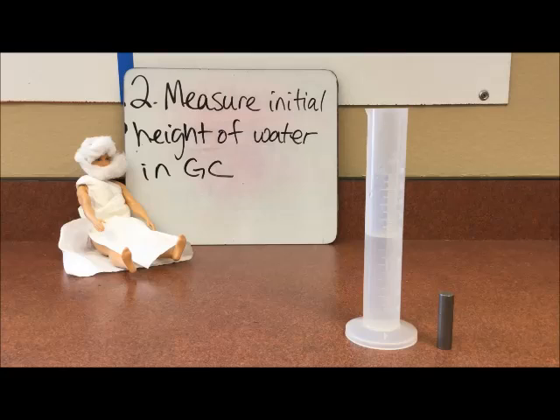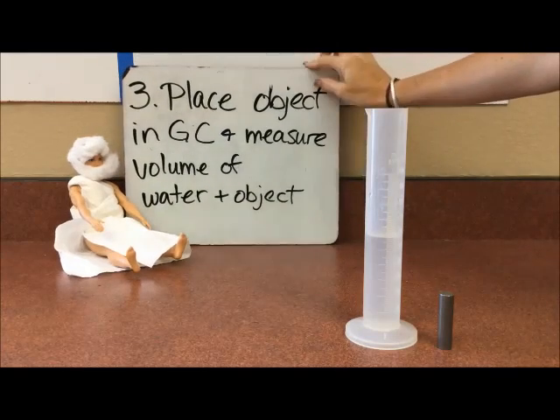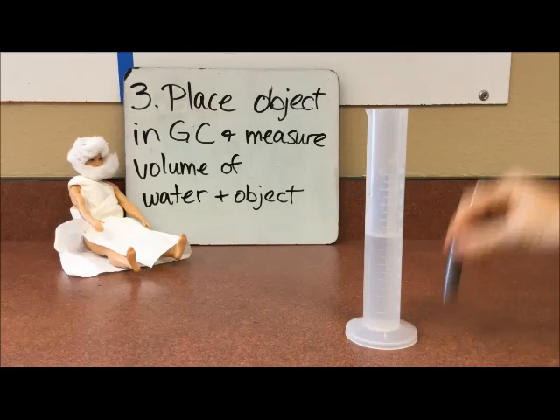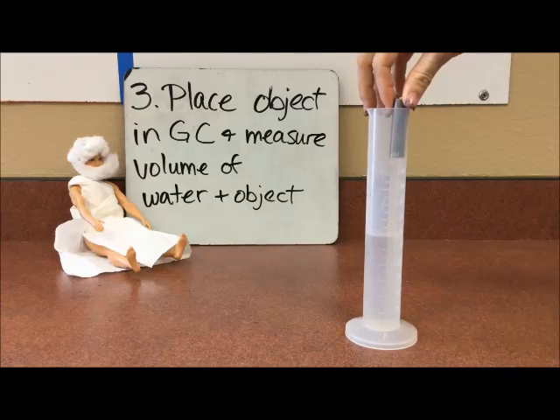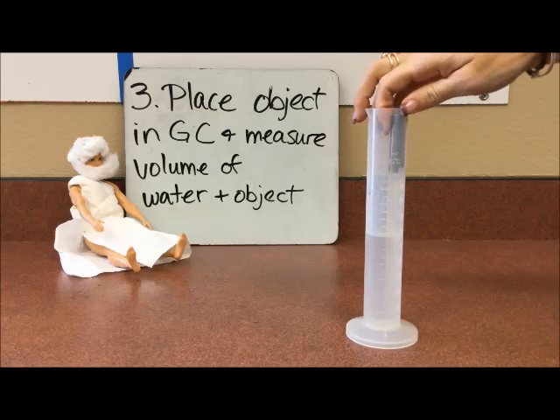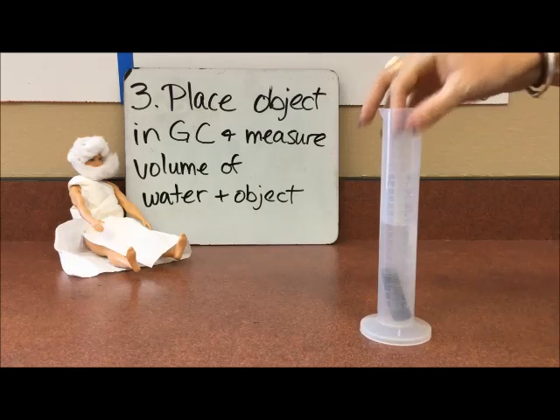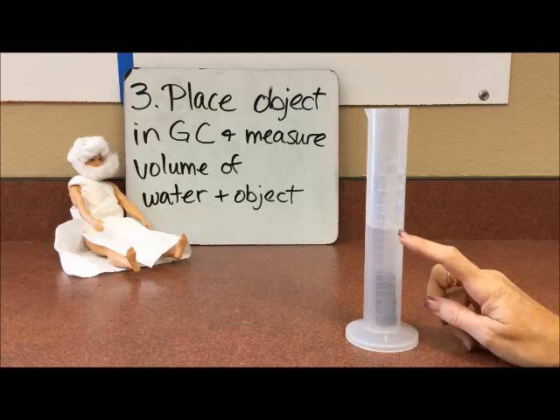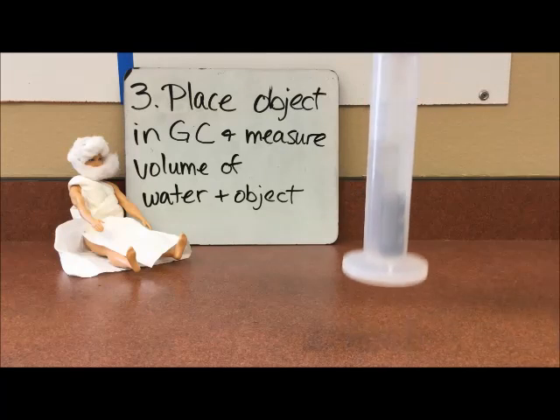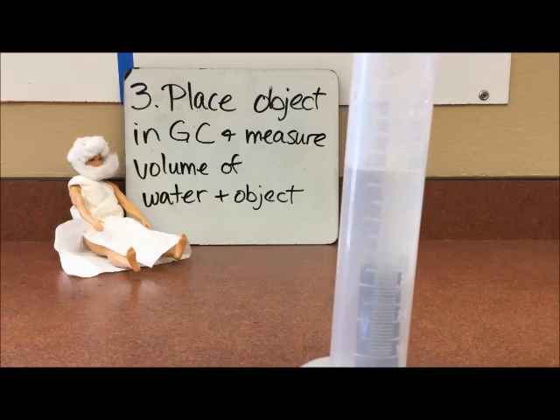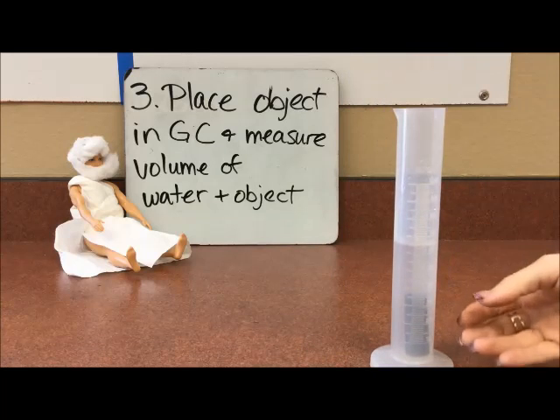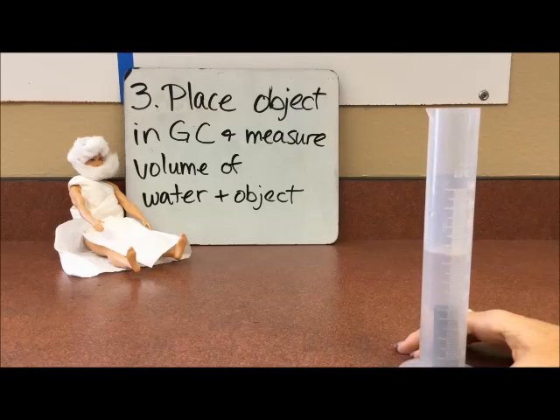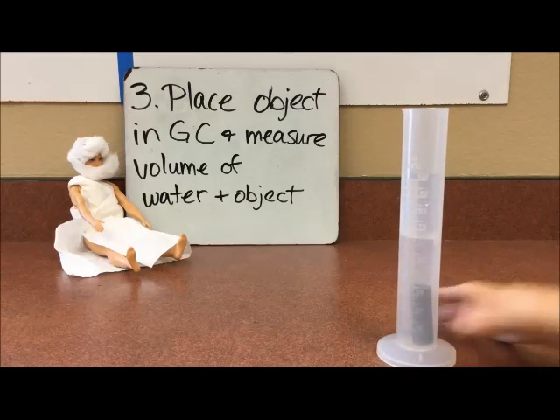Step three: we got to keep track of that number too, so you're gonna have to jot that down somewhere when you do your experiments. Then we're going to place—not drop like a cannonball—but place the object in the water, because we don't want the water to splash out. And if you'll notice we were at 59 and now the level of the water has gone up because the object is in here and the water is in here, so they occupy more space than the water itself did. So now we look like we're at about 64 milliliters.